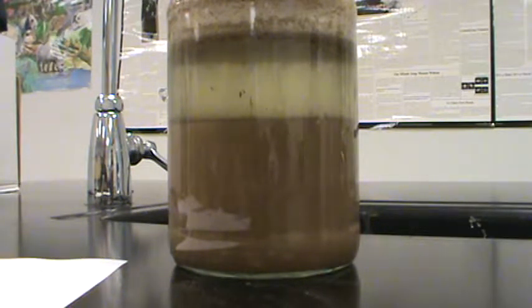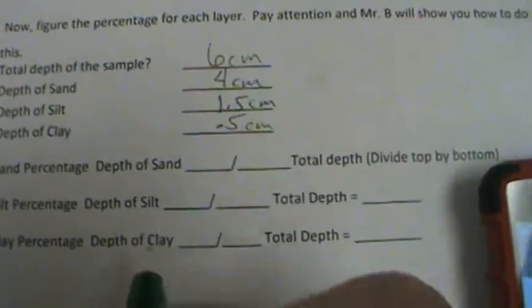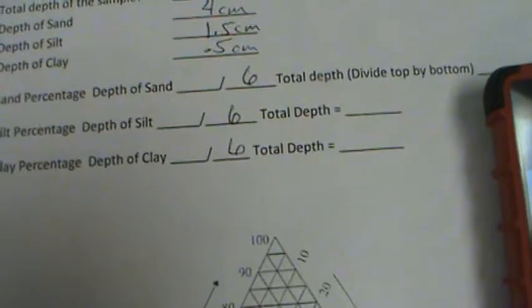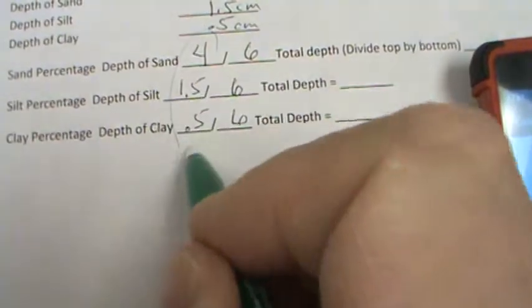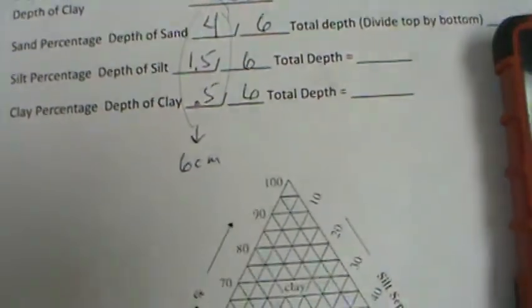I'm going to bring up my handy-dandy calculator here on my cell phone. I'm going to grab you up again so that you can watch me do this right here. So we're going to clear this out. What I've done is I've set this up like a division problem. The total depth goes right here. It's the bottom of the fraction. It is what we're dividing by. Then the depth of the sand is 4. That's the top of the fraction. The depth of the silt is 1.5, and the depth of the clay is 0.5. Please make sure that all of these numbers add up to your total depth, in this case 6 centimeters.